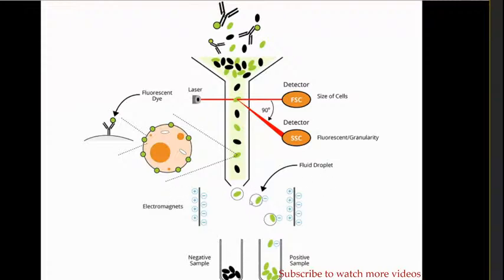Here we can understand the cell surface having the negative charge. So, here they may place the electromagnetic rods. These electromagnetic rods recognize the antigen and the targeted cell. The targeted cells are collected in a separate tube. It's an experimental method. First, addition of the target cell. It's recognized by the detector. Then it's moved towards the end of the pipe. At the end of the pipe, it is separated based on the charge on the surface.